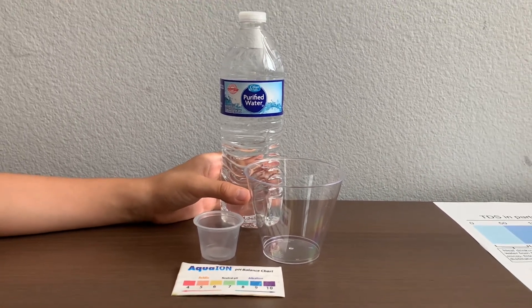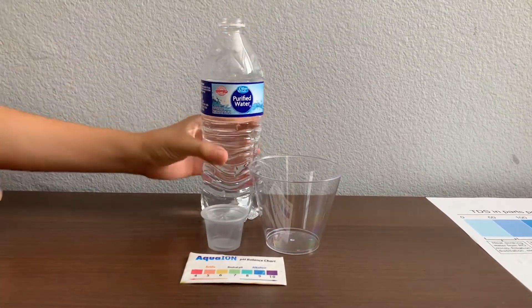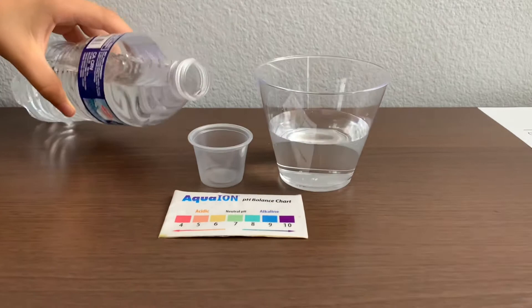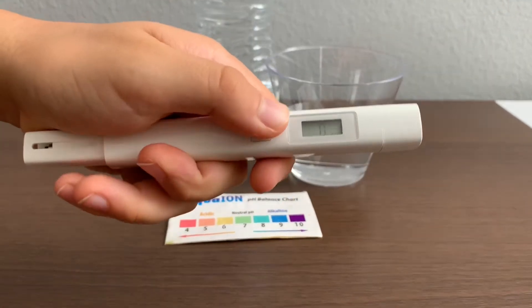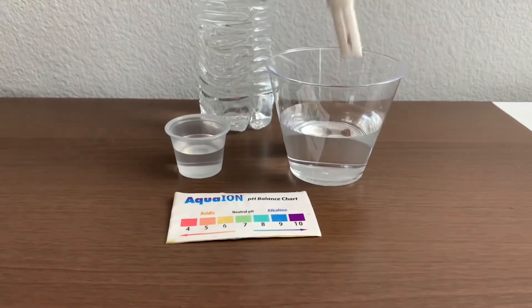Let's test the pH and TDS levels. Turn on the TDS tester, make sure it says zero, and put it in.